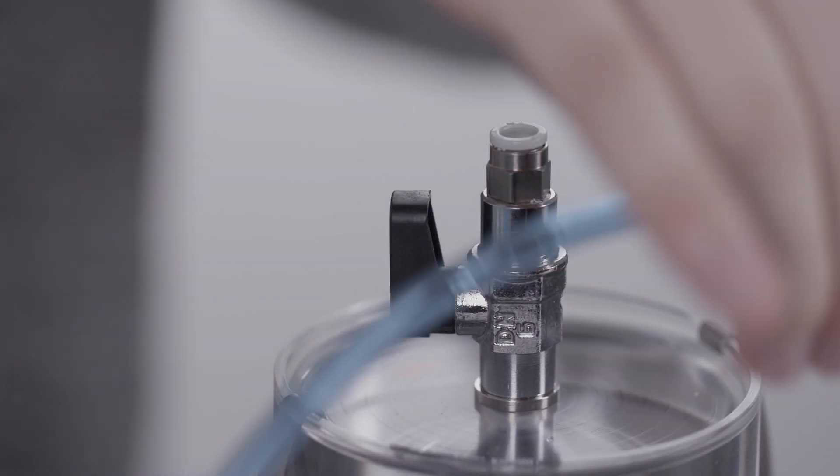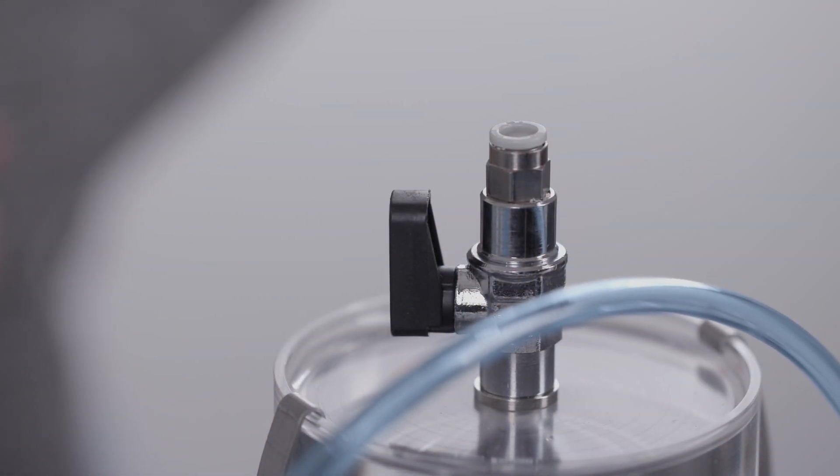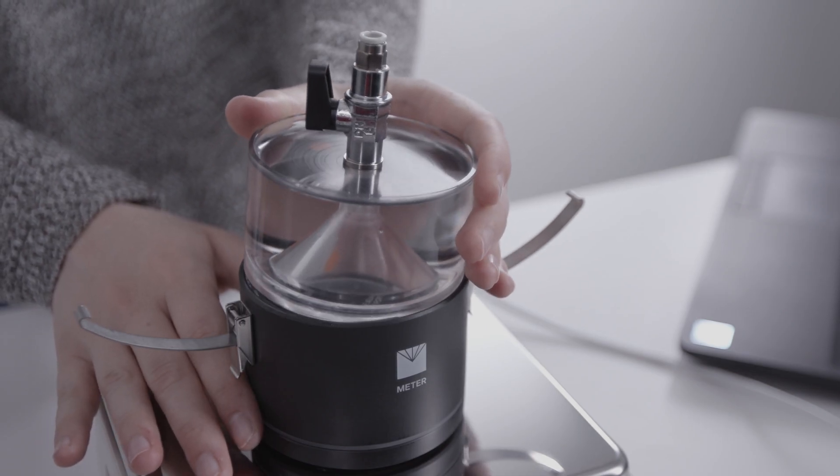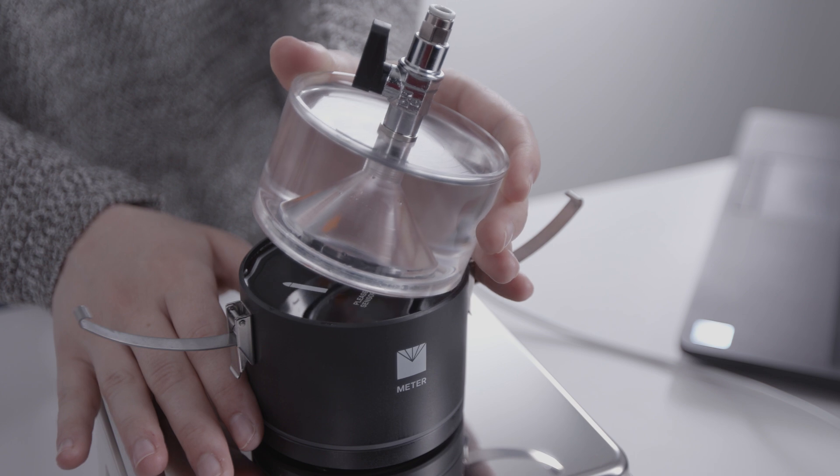Disconnect the HyProp sensor unit from the vacuum refilling station only after the vacuum has been slowly released. Remove the sensor unit refilling attachment by lifting it off from one side.